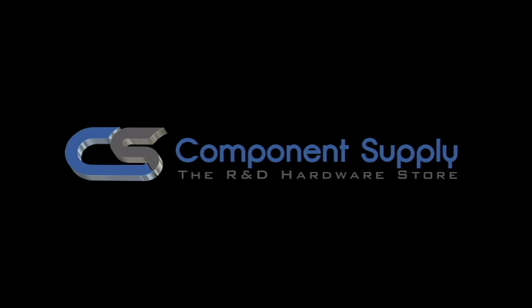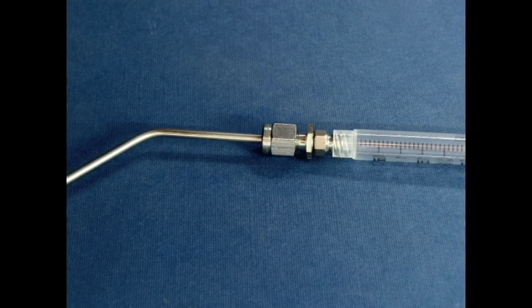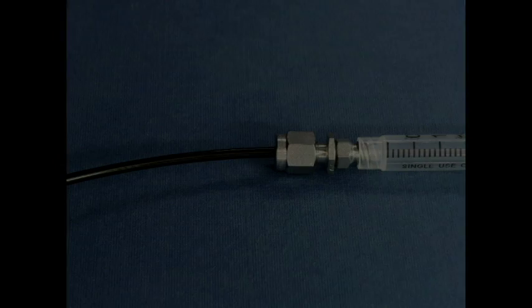I want to show you three potential ways this fitting can be used to make connections to a lure. First, using the metal ferrules that come with it, we can connect fractional tubing that is rigid, such as stainless steel, or semi-rigid, such as nylon.